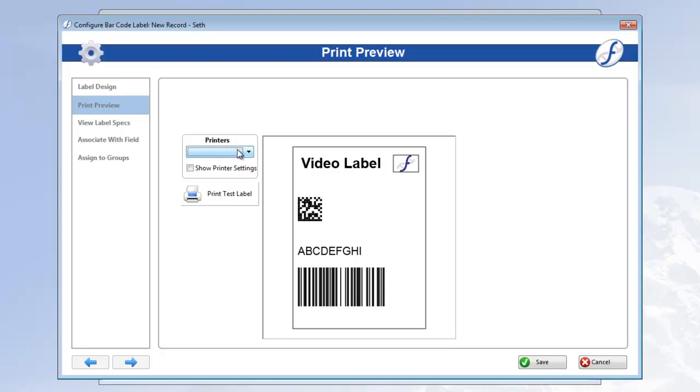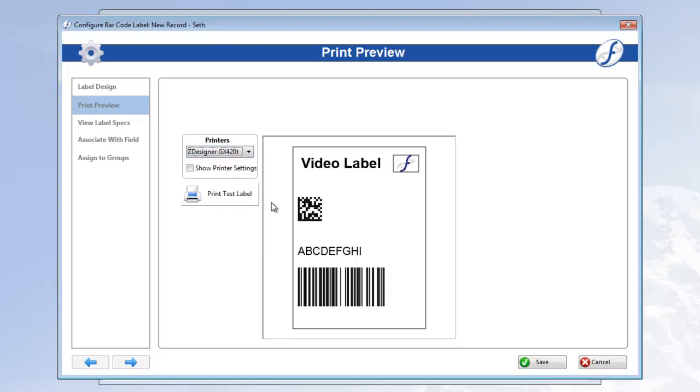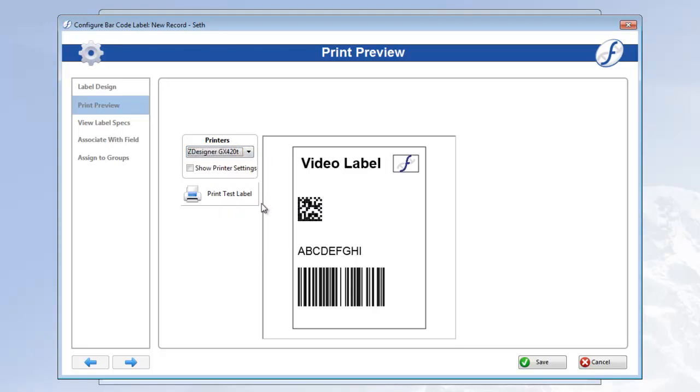I'll go with my zebra printer, then click print test label. And there's my printer doing its thing. My label looks good, so I think we can assign this to our groups and start using it. Make sure to do so either before you save or as you save, like so.